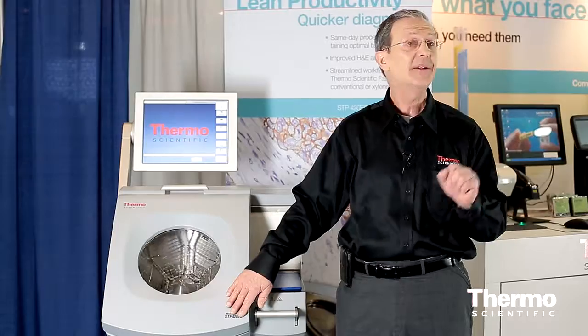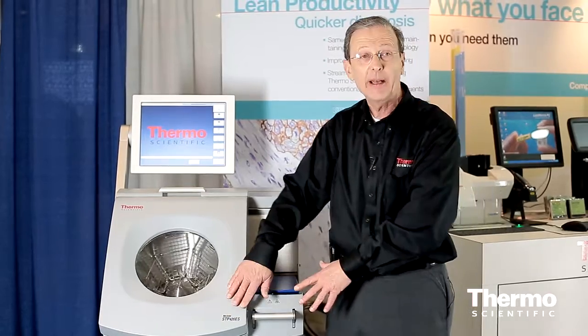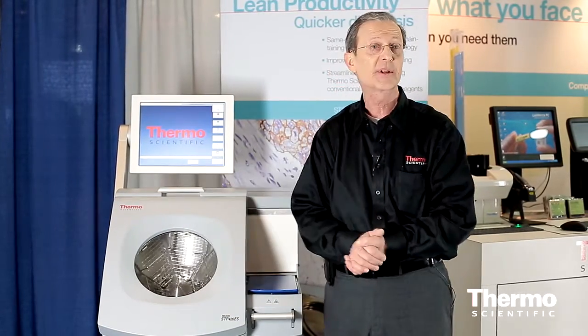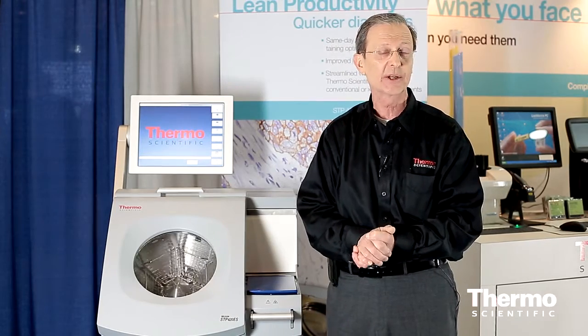And of course, since Thermo Fisher Anatomical Pathology sells both the equipment and the reagents and performs the service, it's easy for you to change your whole processing system and the reagents at the same time to really optimize quality in the laboratory.